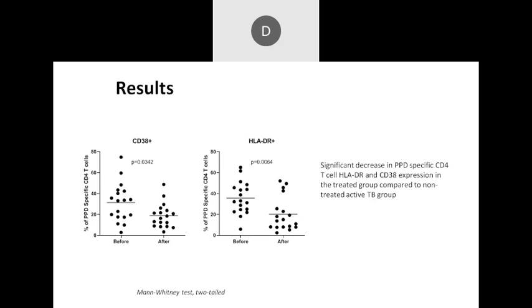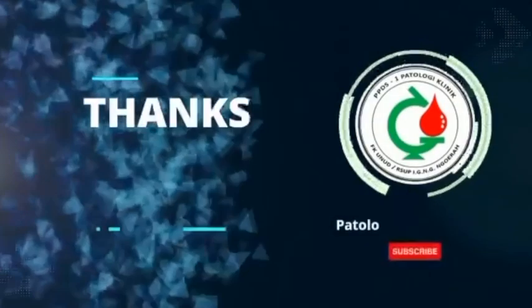I mean, the quantiferon is you take this blood, you stimulate a day, and then you measure the cytokines. Well, the only thing we're doing different is we're staining the cells. Whole blood assays are a lot easier to standardize than isolated cells. So, you know, the quantiferon, they've developed it very well. You take the blood direct into the tube, stick it in the incubator, and then assay the supernate.